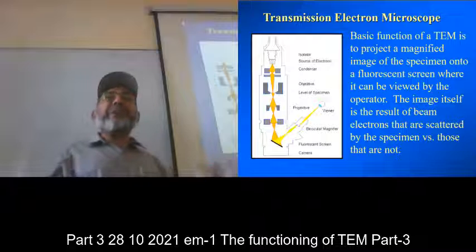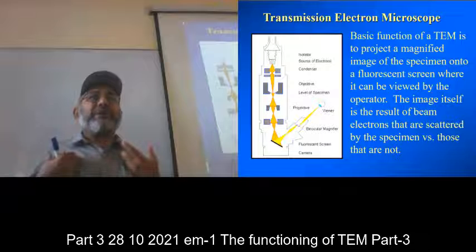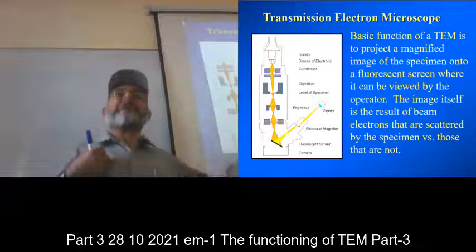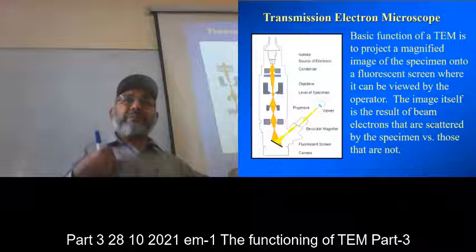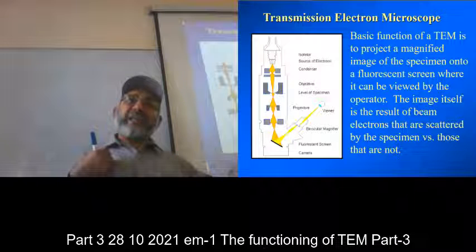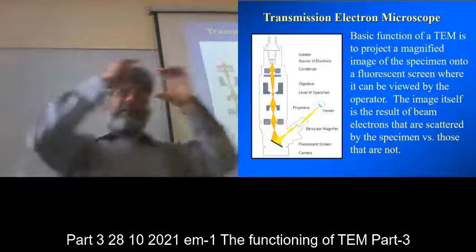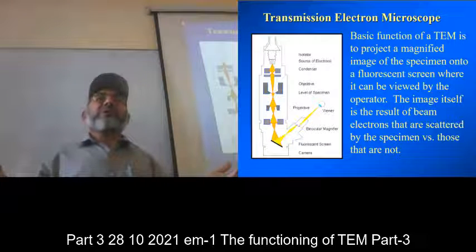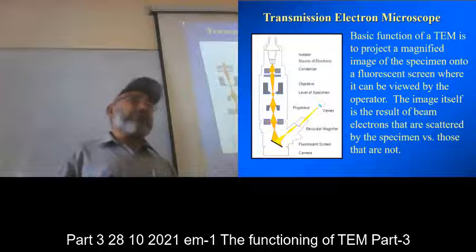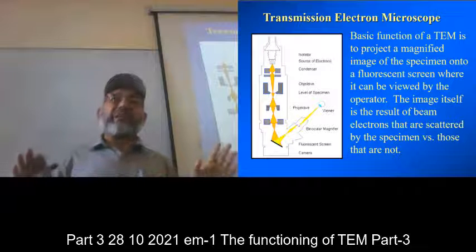That image can be shown to an illiterate person to say yes, I have done microscopy, but technically that image has no scientific information. You are talking in terms of nanometers and angstroms, and when you are taking an image from here or here, there is no trust in how much magnification was done when imaging something, right?